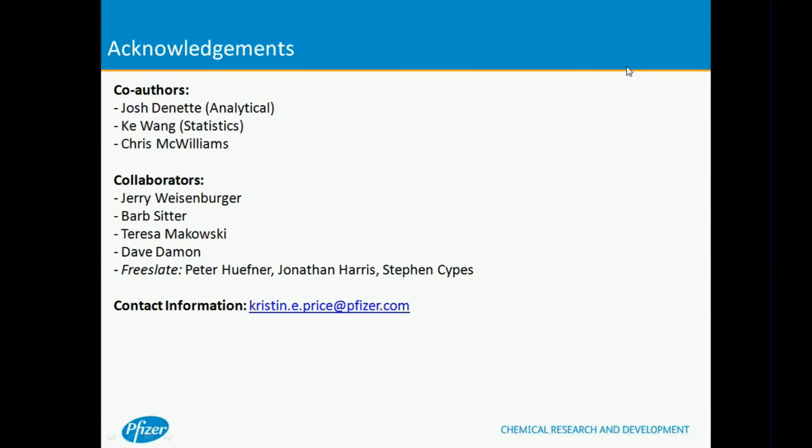Another question that's come in is, where in the overall development timeline do you utilize these tools, i.e. prior to the initial scale-up? We screen reactions that are in all stages. So this tool and other high-throughput screening tools could be used on something as early as the first clinical batch, and it could be as late as going into manufacturing. So we see the whole range.